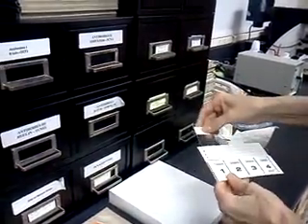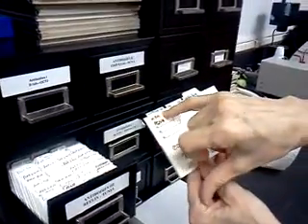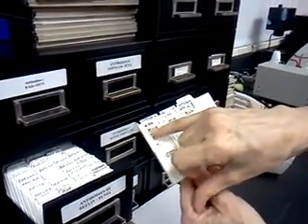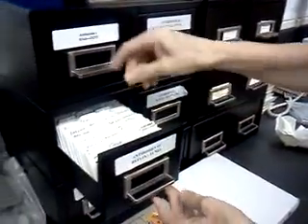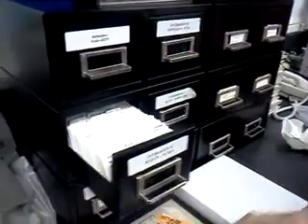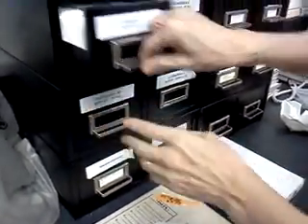And they're little index cards. And then you just put your slide in here, and it'll have what it was that you did. So here's our identifier at that time, the date we did it, and what's going on in this slide. Okay.